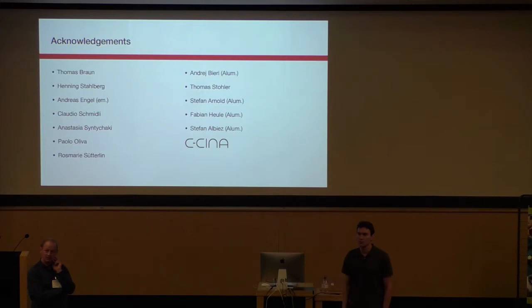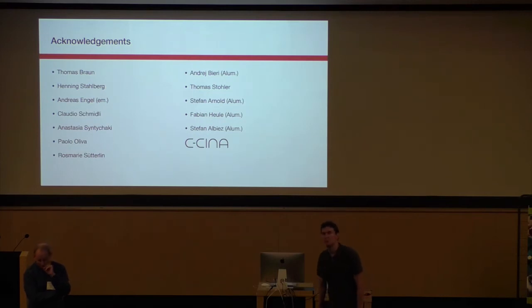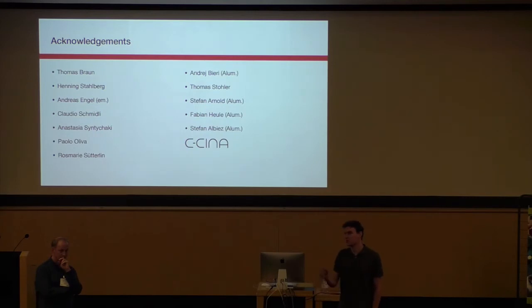Yeah. That's really interesting, because I think colleagues who've used systems like the Spotiton have reported that for the Spotiton, for example, you need slightly higher concentration compared to the Vitrobot. So can you speculate as to why that would be? Because both of your systems have similarities in terms of applying particular volumes onto the grid. I would just be speculating. The Spotiton is still a bit like blotting by having a self-blotting grid, so maybe it's the flow within the squares, or maybe it's because I have a little bit of evaporation, not a lot, but it maybe also drives a bit the concentration there. But it's just what I'm seeing. I have not looked into it in a very scientific way. It's just my experience that I see more particles usually if I compare to the Vitrobot.